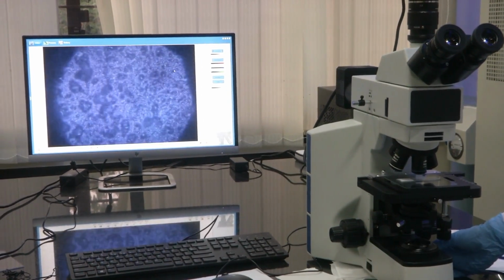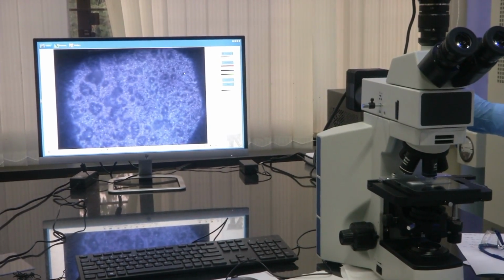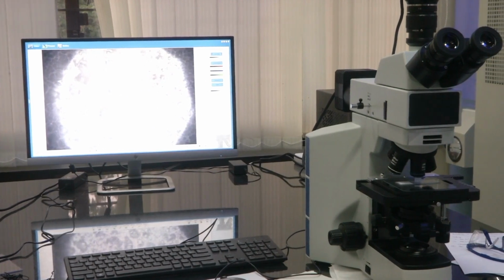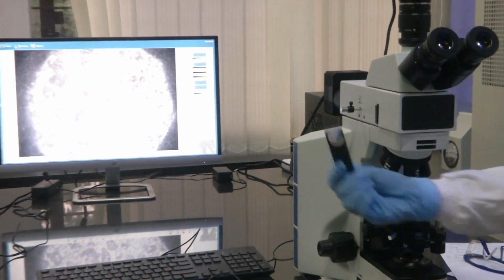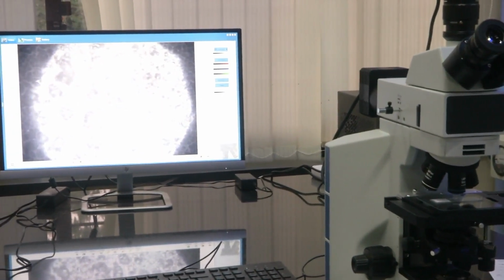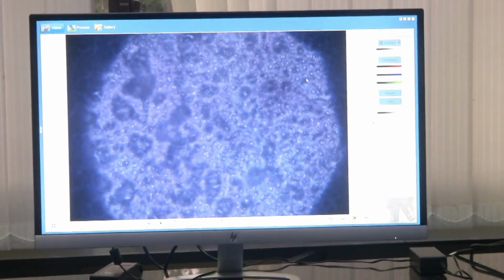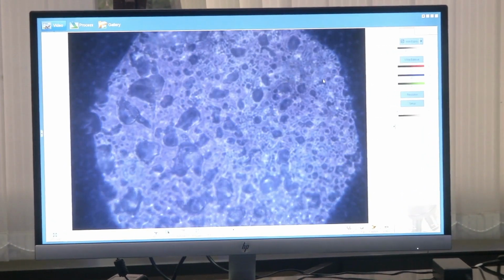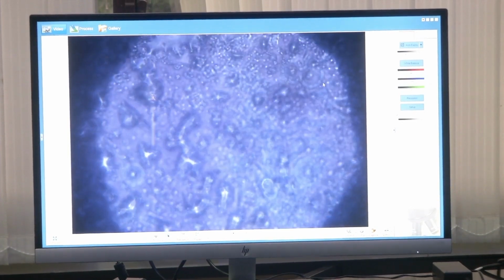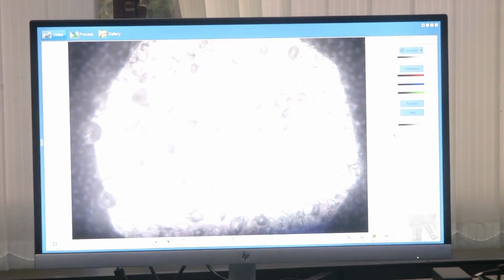At that time, see, the image seen is slightly different, because we have used a blue filter. Let us say I remove the blue filter, you will get white color. So, I have removed the blue filter that was kept. Let me put it back, then you will see that the image has become blue. And you are seeing a circular image, right? That is because we have put a circular filter like this.